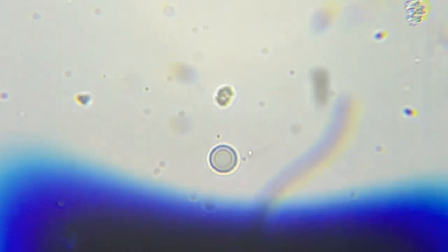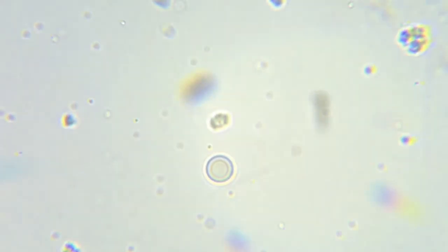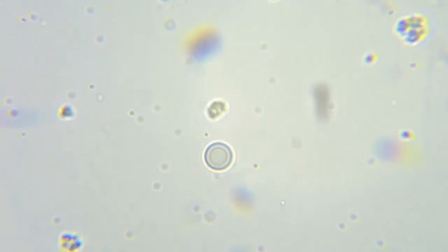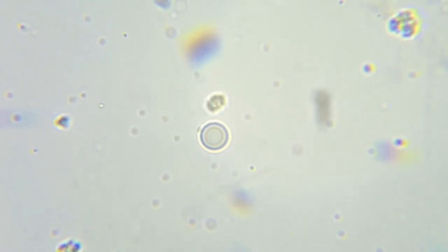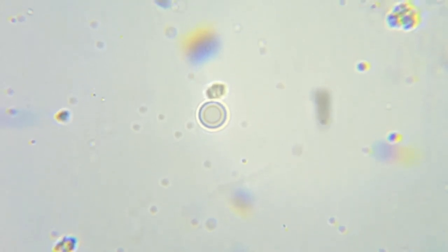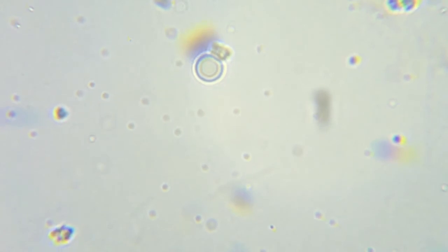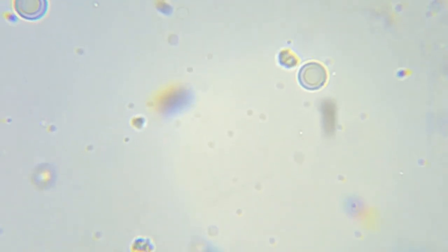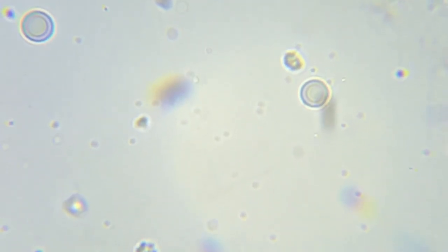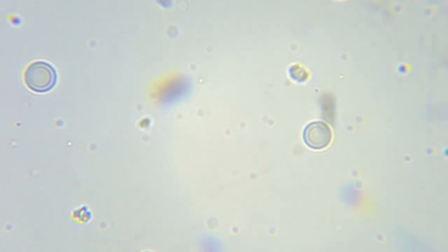We can get them to go, oops, excuse me for just a second while I get this back into focus. So it's a little bit more persnickety when it comes to focusing. So I'm going to see if I can get it now to move while the other smaller 1-micron beads are standing still. And you'll notice that this is opposite to the electric field that we were doing earlier, so it can't possibly have anything to do with the electric field. I'm going to now make it go back in the other direction. Oh, a couple of them, good. And why is that happening?